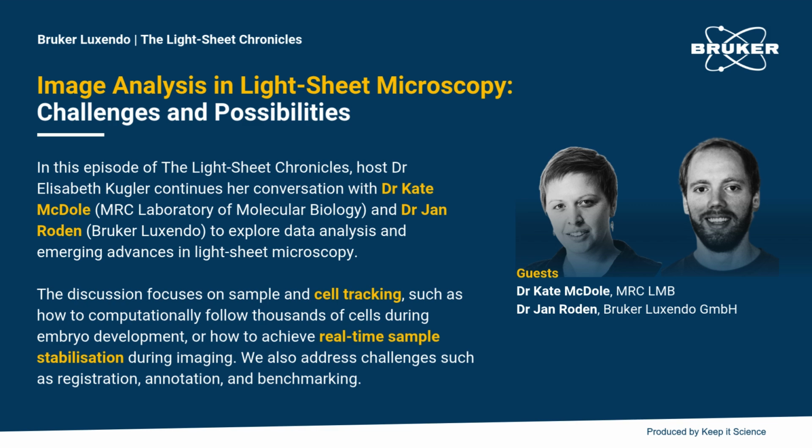And when you have issues with signal to noise, if two cells get too close to each other, they can look like one cell. So we're trying a number of different methods to train these neural networks to predict the motion of the cells, so that it knows if two cells come close together, even if they look like they're fusing in an image, that those are two cells in the next time point, and to continue tracking those.